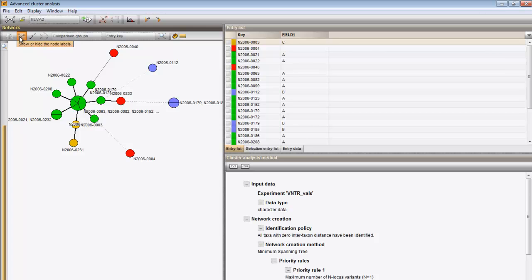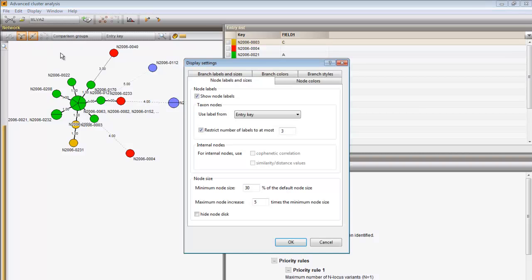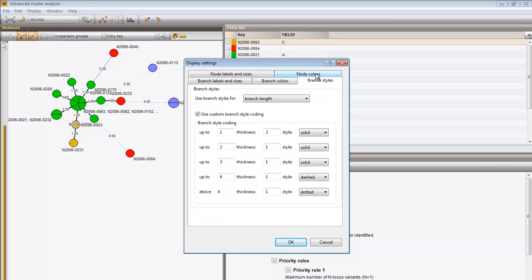The branch labels can be shown as well, which in this case are the distances.